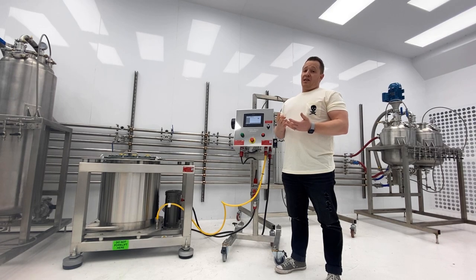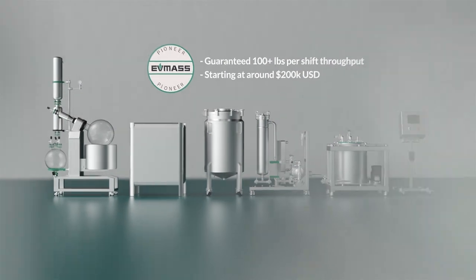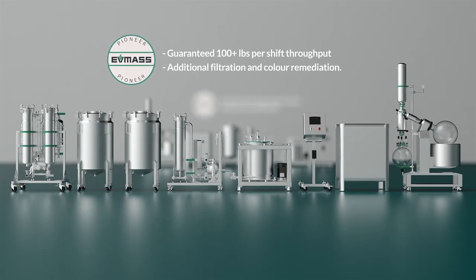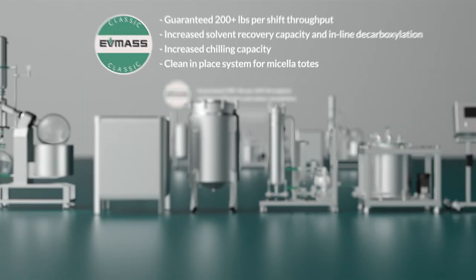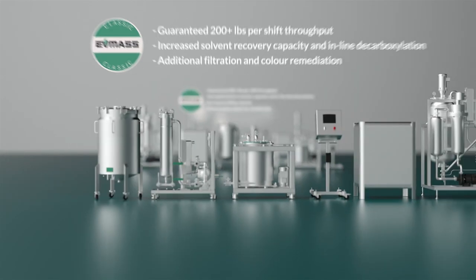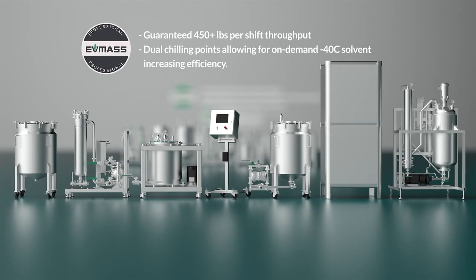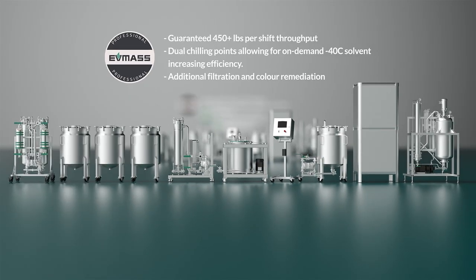The three configurations that can be customized are: the Pioneer configuration, capable of processing 100 pounds of biomass per 8-hour shift; the Classic configuration, capable of processing 250 pounds-plus of biomass per 8-hour shift; and the Professional configuration, capable of processing 400-plus pounds per 8-hour shift.